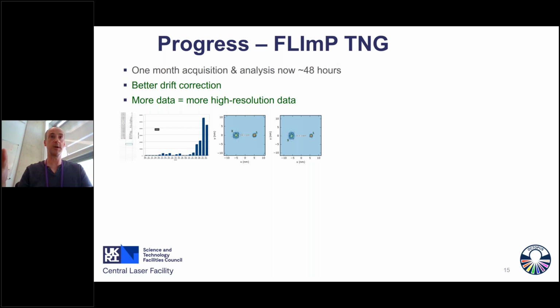We were able to do this work with our Nanoimager automated analysis just with someone who was able to come into the lab, because a small number of people could come in, and who was actually able to put the samples on the microscope, and everything else was basically happening remotely. So this enabled us to acquire far more data, enabled us to actually take data at all during the pandemic.